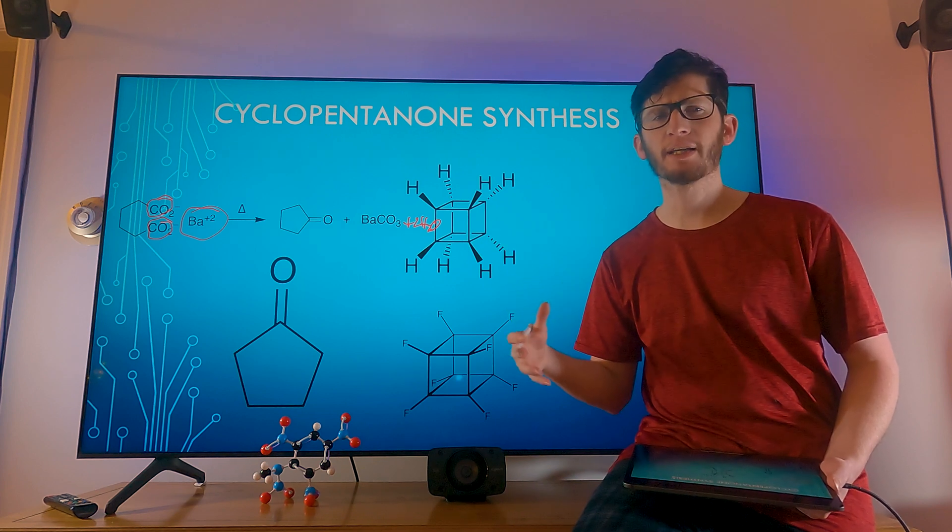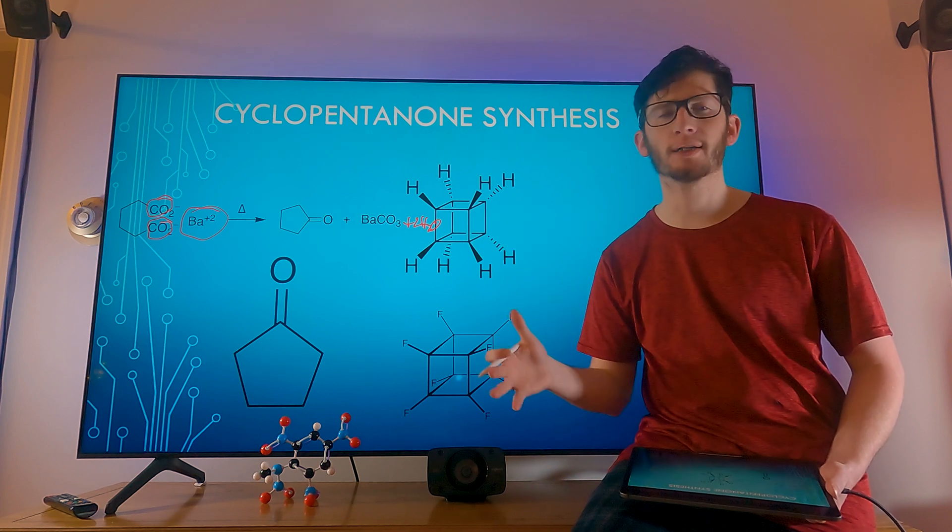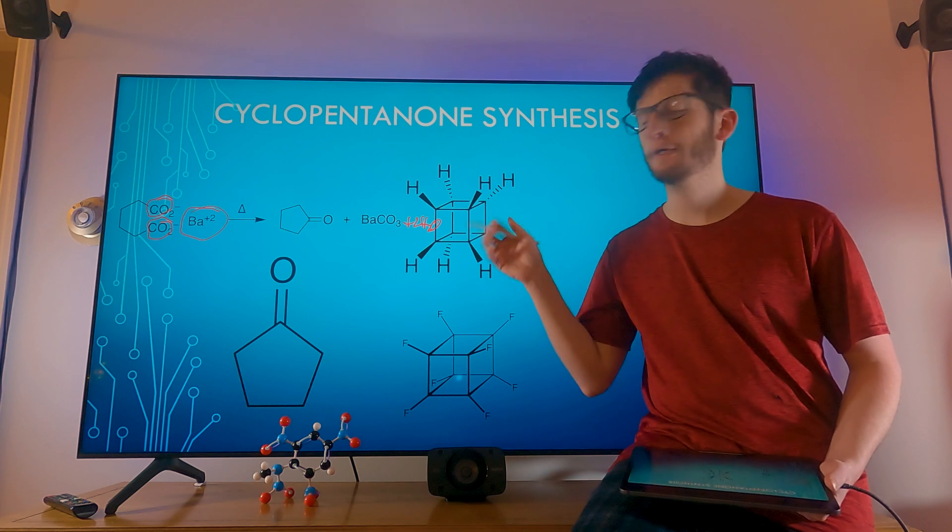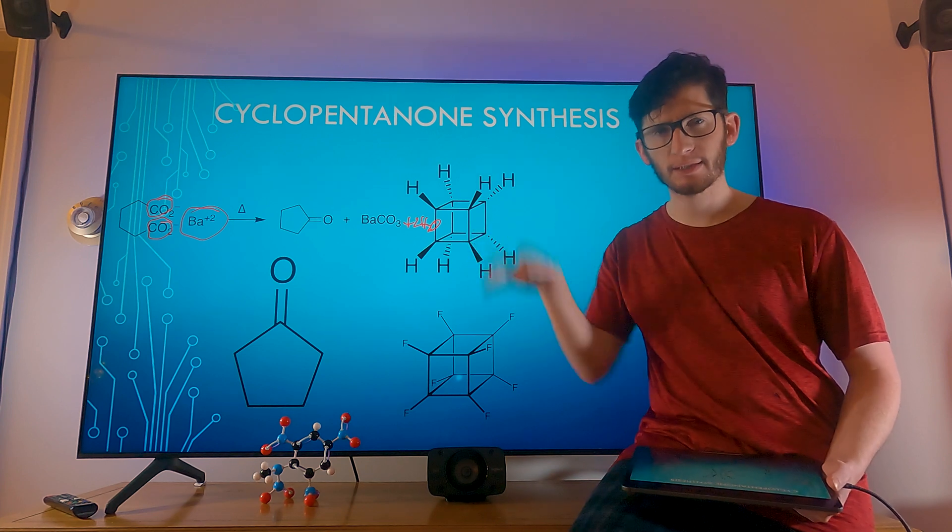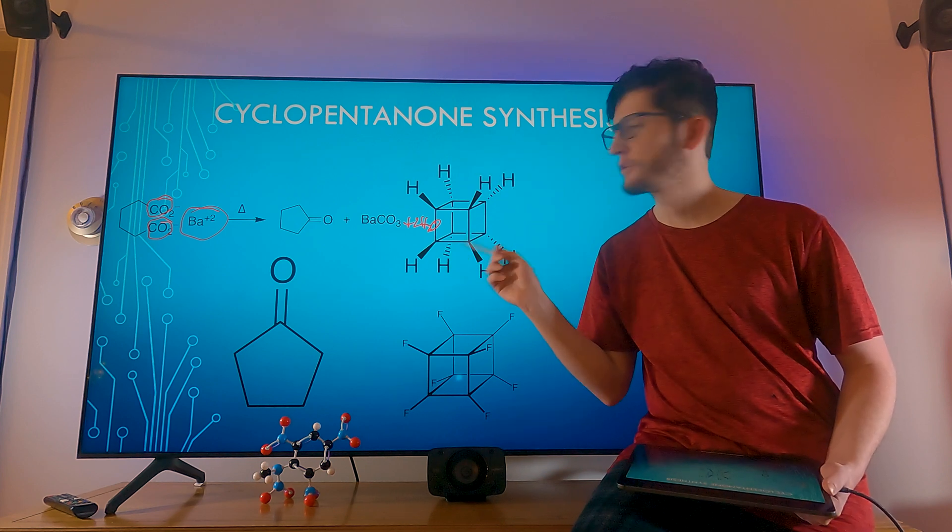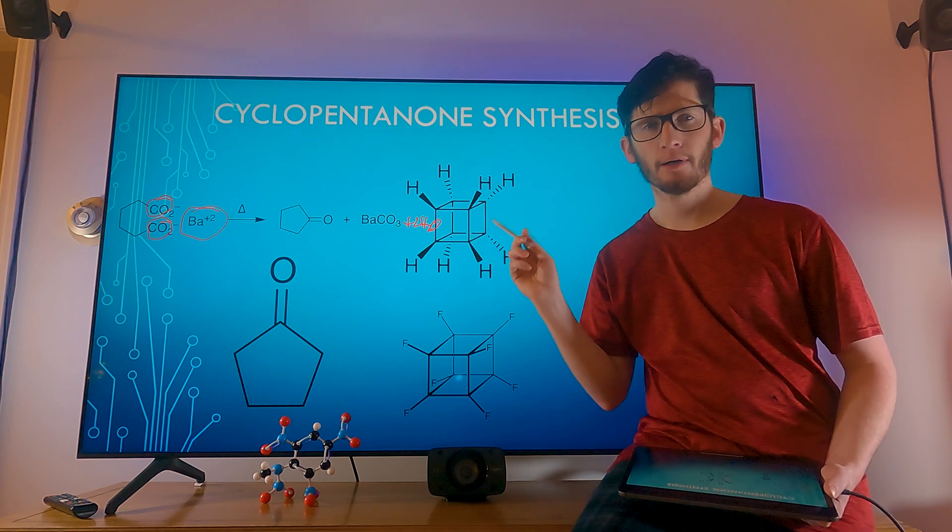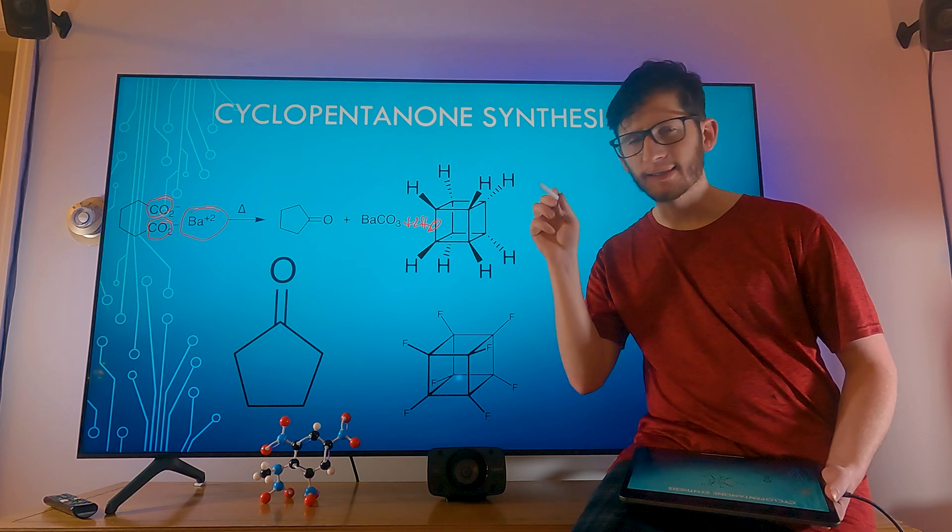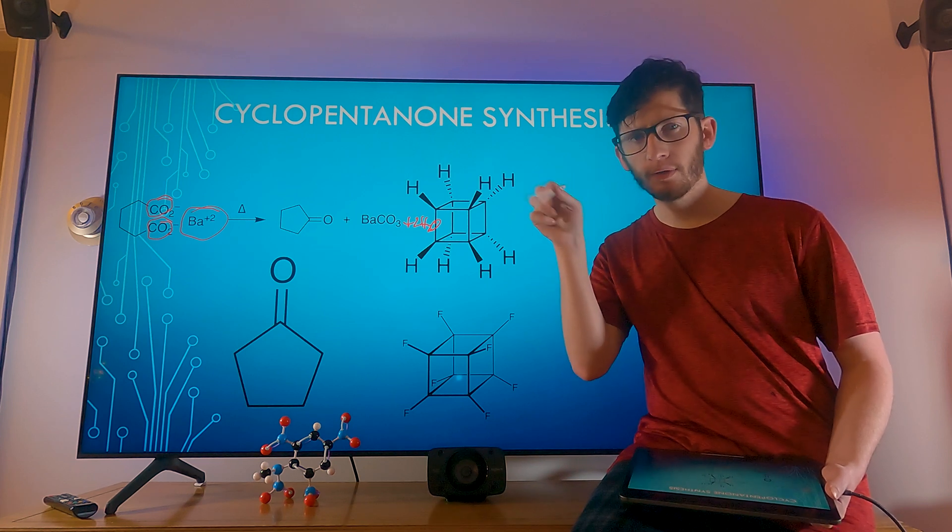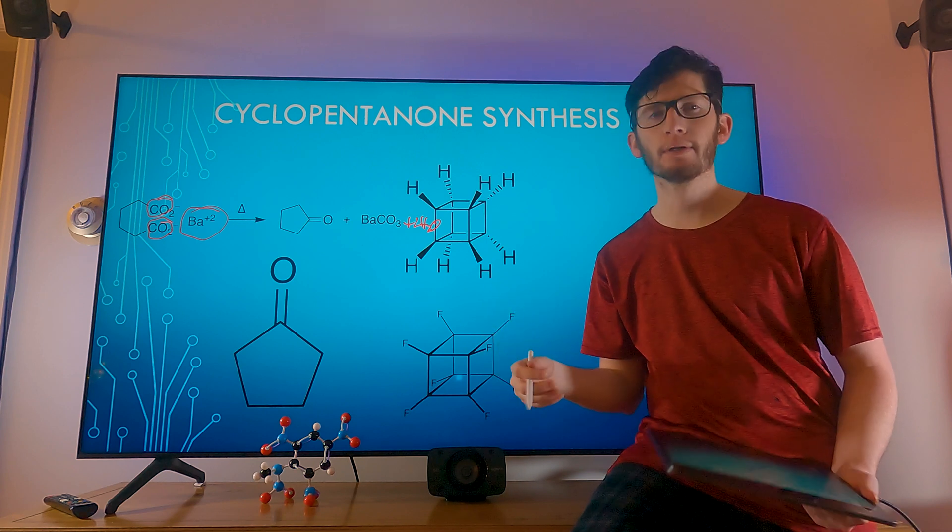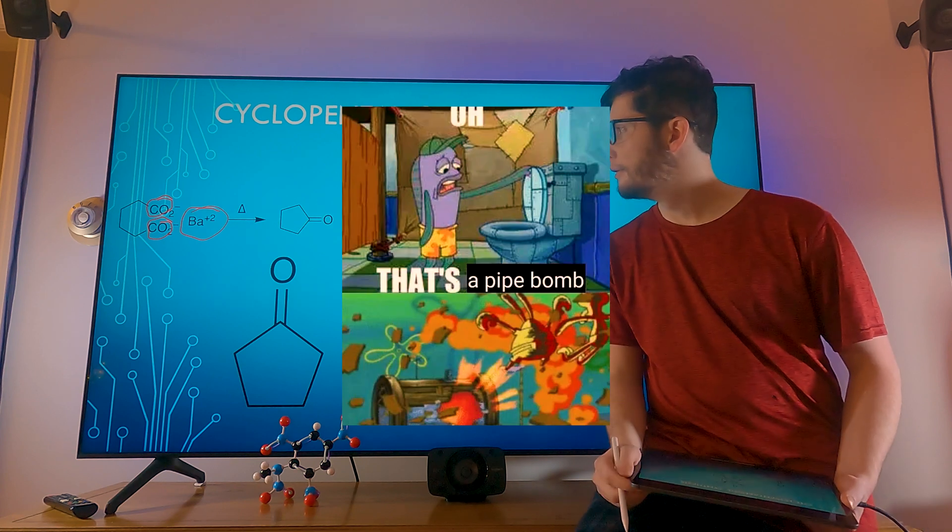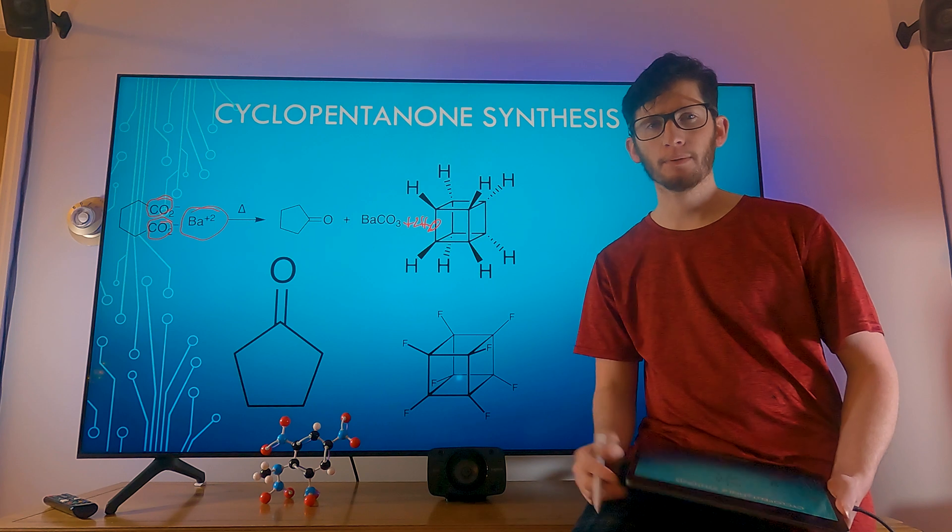This is going to be very finicky and annoying and you're going to have to watch it the whole time because if you go over 300 degrees, a little bit of wiggle room there because I'm going to extend my column, you will start to get adipic acid coming over and it will condense right in the hole, the start of the condenser and it will clog your condenser, and that's a bomb. So we'll try to avoid blowing anything up and we'll get to it.